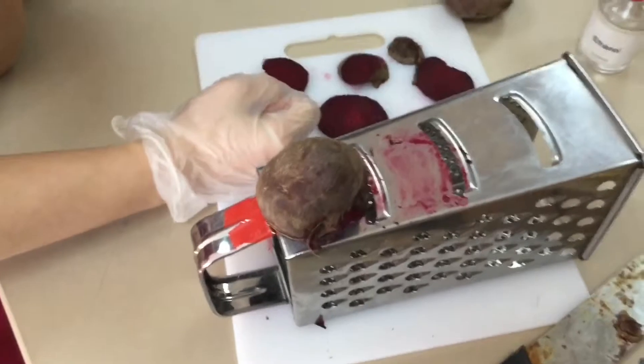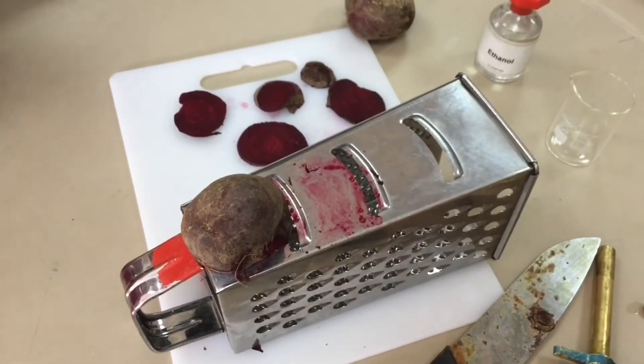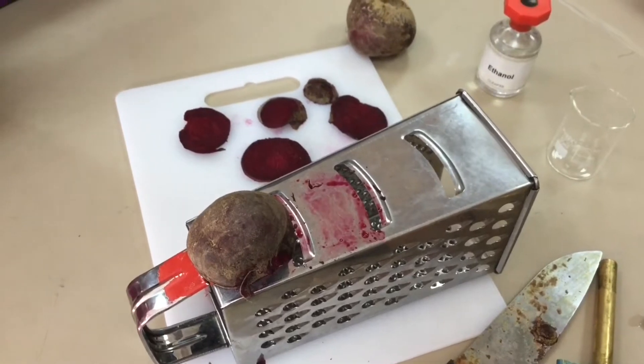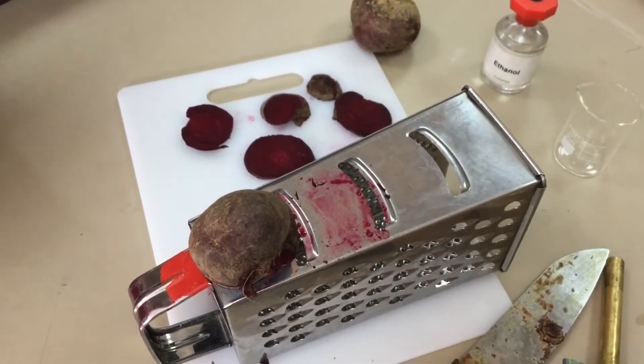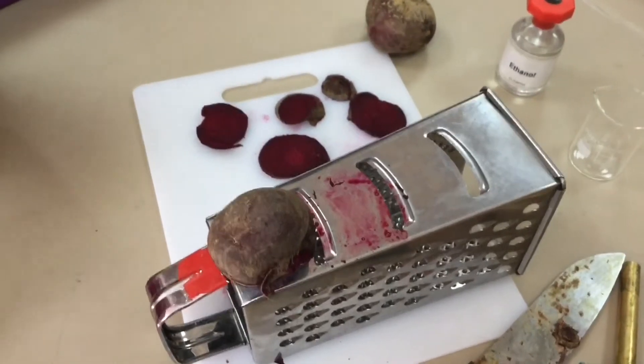Today's required practical is practical 4, titled Investigation into the effect of a named variable on the permeability of cell surface membranes. The cell surface membranes that we're going to use are that of beetroot.